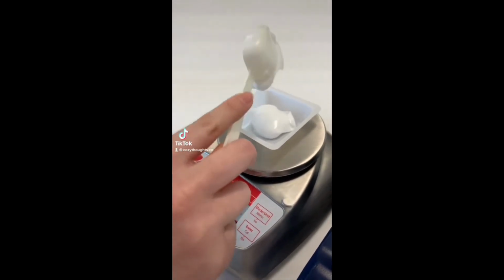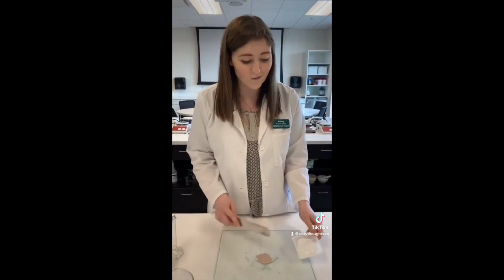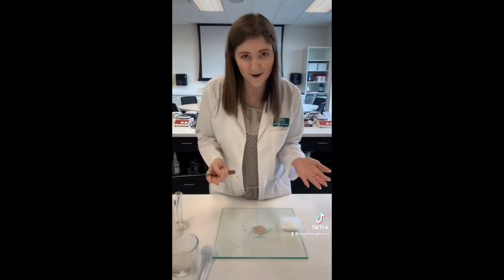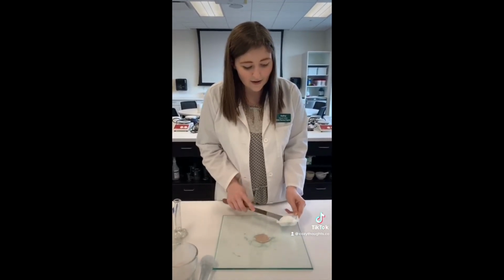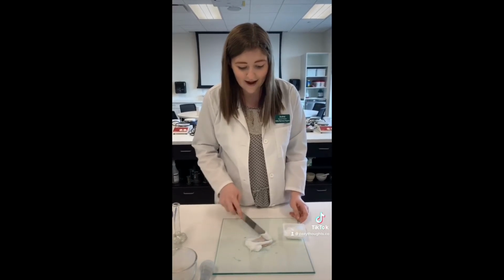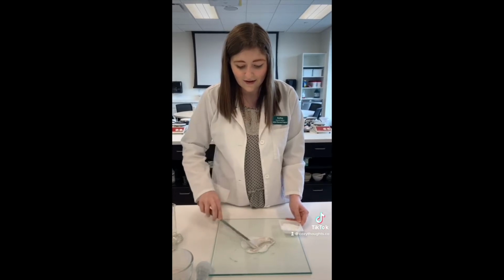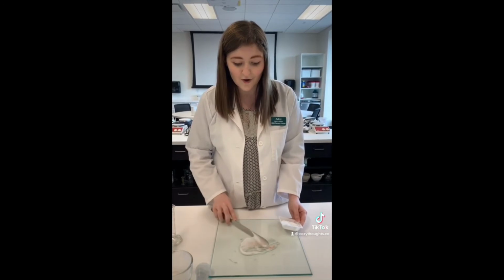Now I'm weighing out the ointment base, which is Vanicream. Now we're going to do what's called geometric dilution. I don't want to just scoop all of this lotion into this drug, which is the Smarty paste, because then it won't mix evenly. So I grab a little bit about the size of my blob of Smarty, add that together, and swoosh it more evenly. You might have noticed I'm using a larger spatula now because it's easier to mix the drug with the cream.